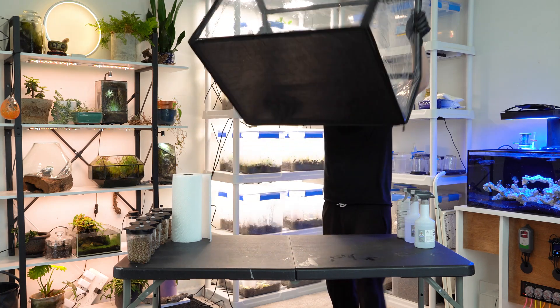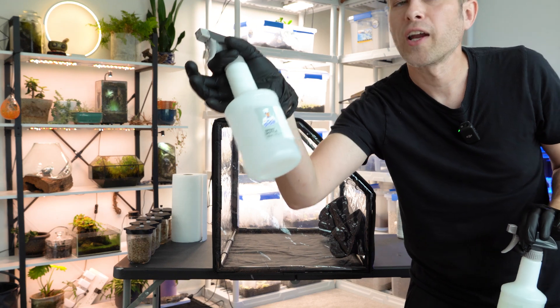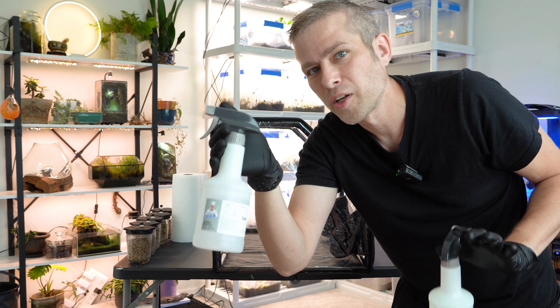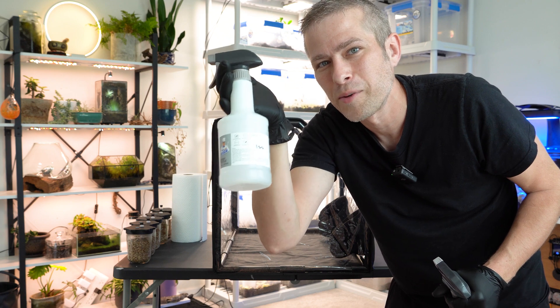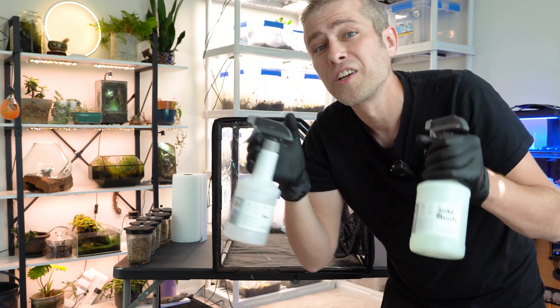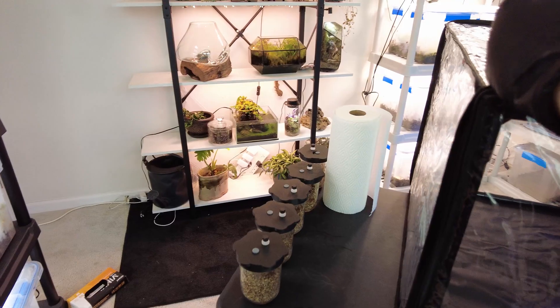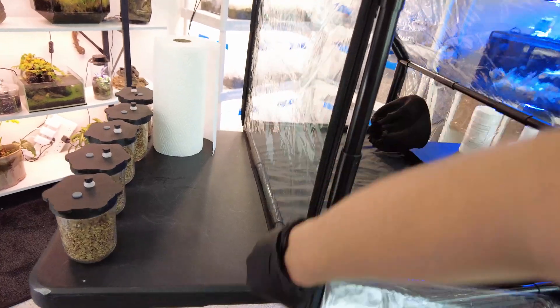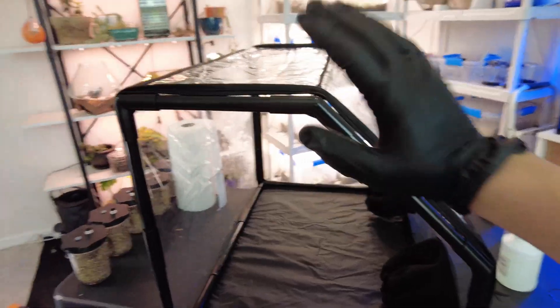Before we go any further, we're going to get inside our still air box. We're going to wipe everything down with a mixture of bleach and water, as well as spray everything down with 70% isopropyl alcohol. This is used for sterilizing pretty much everything in the hobby spectrum of mycology, so get yourself a whole bunch of it. And if you're worried about getting into mycology because you don't have a still air box, don't worry — I'm going to show you another method at the end that you can use even without one.